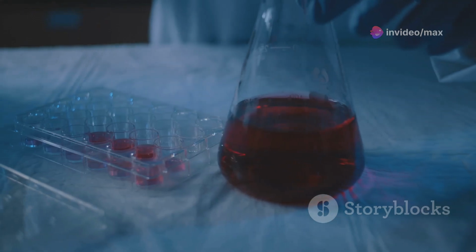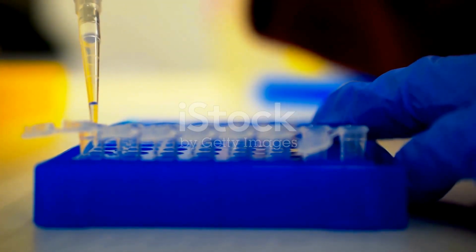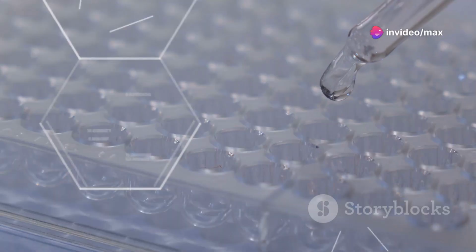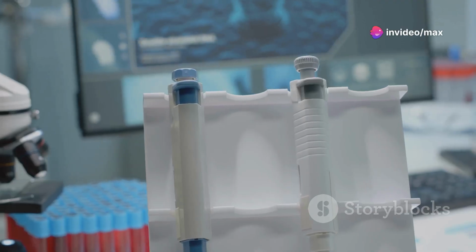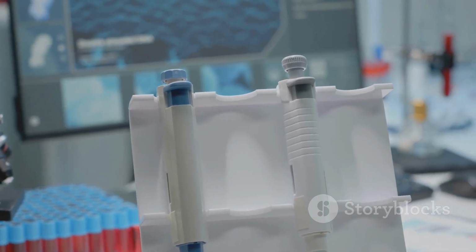When we add a specific substrate to the mix, the enzyme springs into action. It modifies the substrate, causing a detectable change, often a change in color. Imagine the enzyme as a tiny artist carrying a paintbrush. The substrate is like a blank canvas. When the enzyme encounters the substrate, it paints a colorful signal telling us that our target molecule is present.